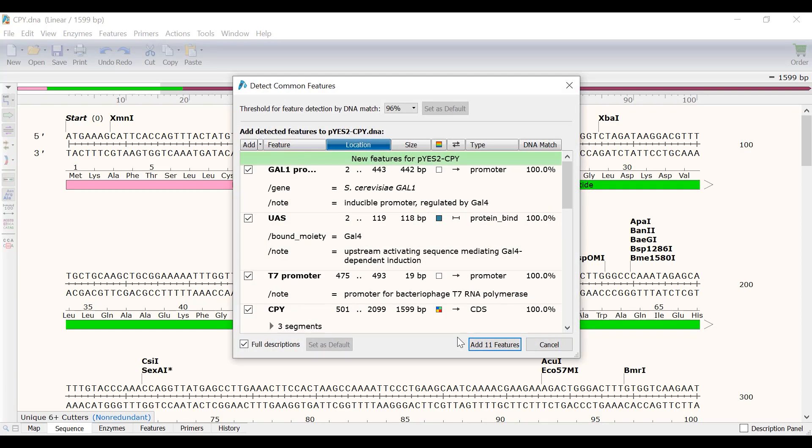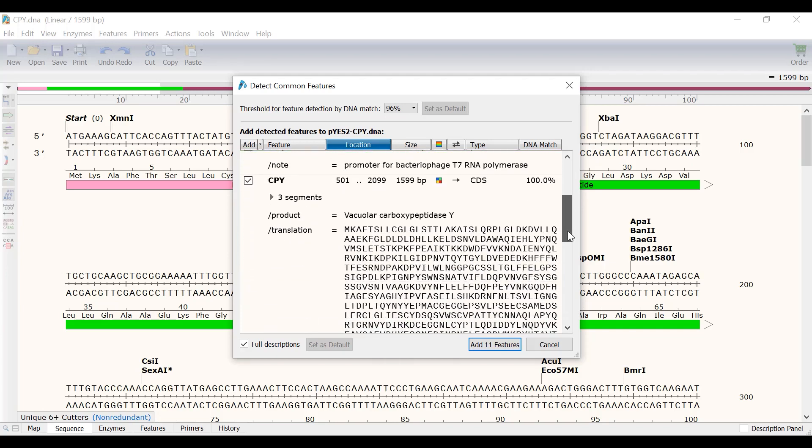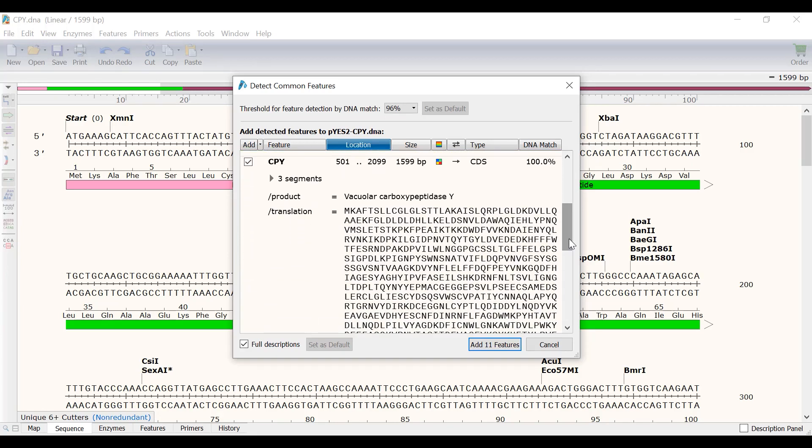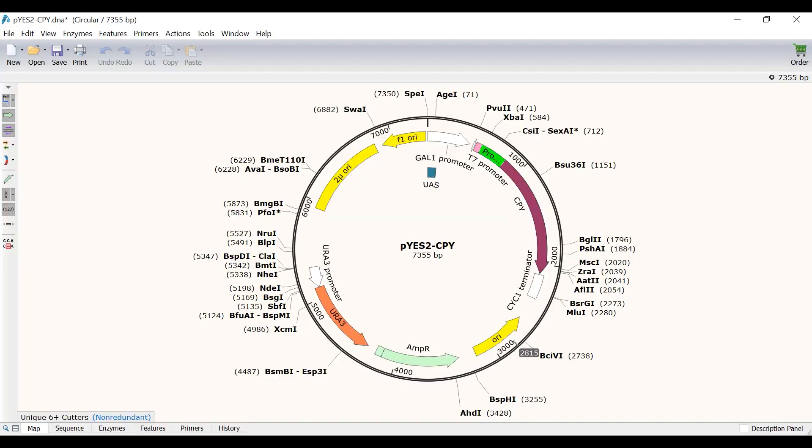Snapgene will then detect common features within this sequence. With the match threshold set at 96%, Snapgene has detected 11 features. If I scroll down, you can see that the CPY custom feature I recently created has been detected with a 100% match. I will select Add 11 Features to add these to the file. In the map view, I can see the automatically annotated CPY feature.